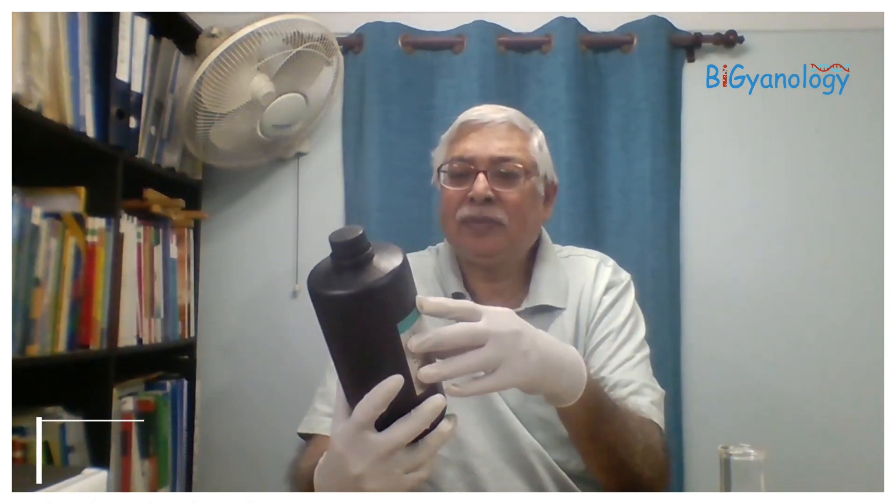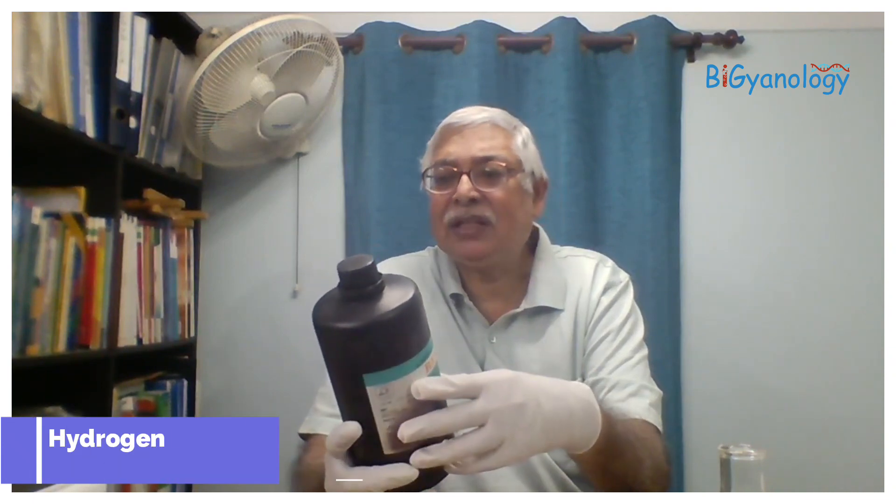Hello and welcome to Beginnerlogy. After a long time we are again showing some experiments. Today I will do a small experiment with chemicals. Basically we need some hydrogen peroxide — it's better to get lab grade which has 30 percent volume by volume.